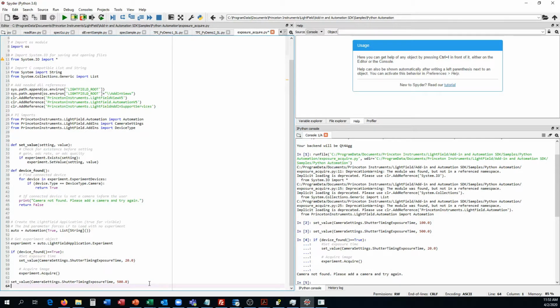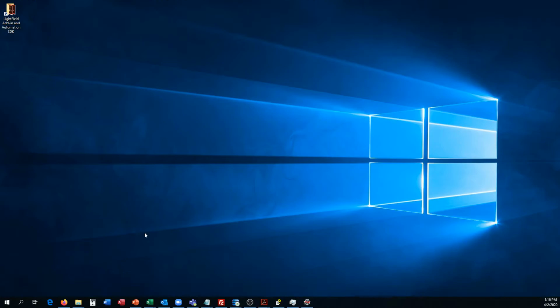And next we're going to cover how to load a demo camera, a software emulated demo camera, into the automation, so that if you're in a situation, for example, where you're working remotely, you don't need a live camera with you to test out or to build an automation code. So now we're going to demonstrate how to use a software emulated demo camera, which you can use to do your automation projects remotely or any other way you see fit.